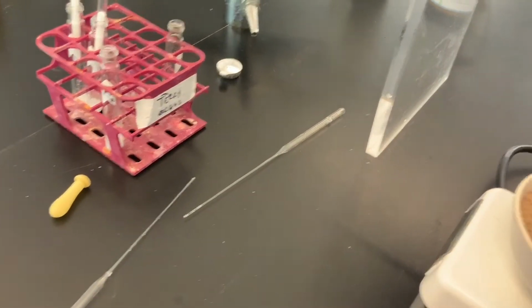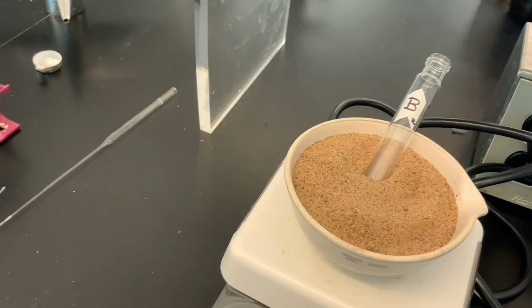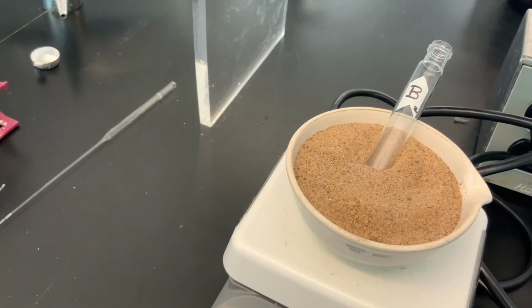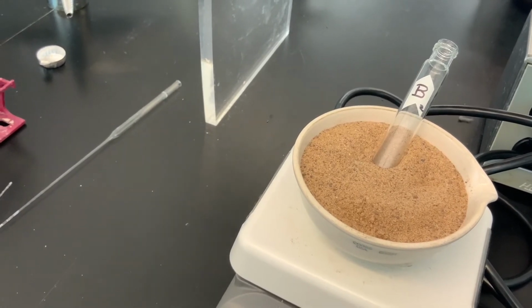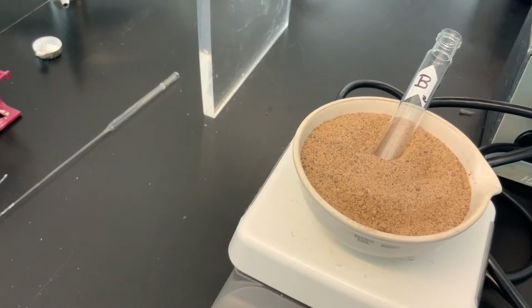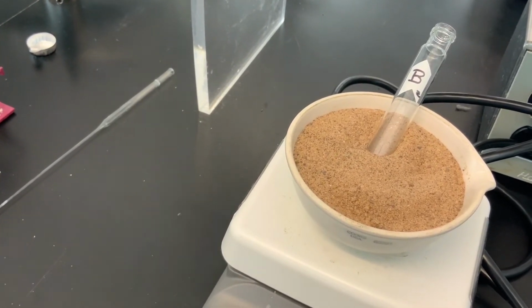And then we're waiting for this methylene chloride now to evaporate. We'll get the mass of the 2 culture tubes now, subtract the tare weight, and that's how we'll calculate how much benzoic acid is in the culture tube, and therefore how much benzoic acid was in the organic layer.